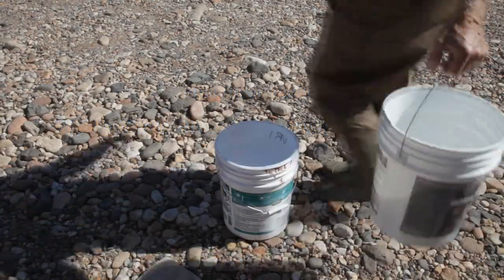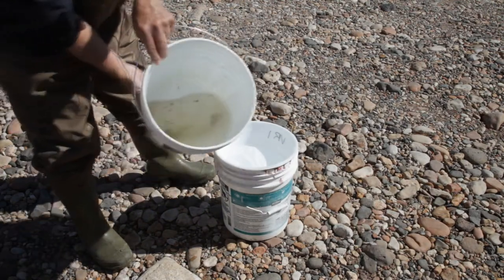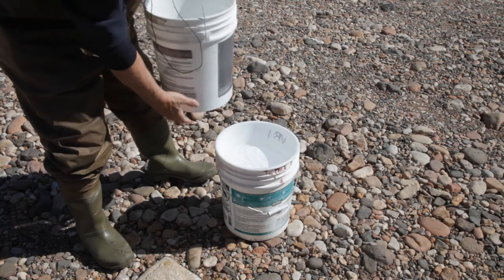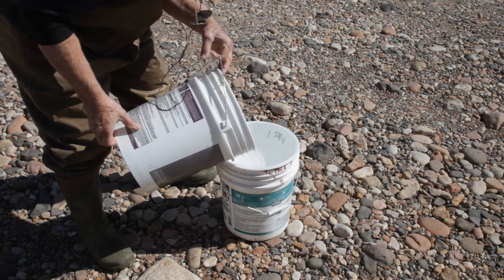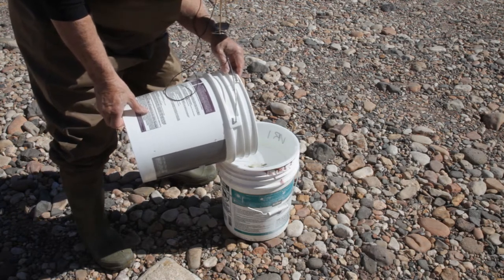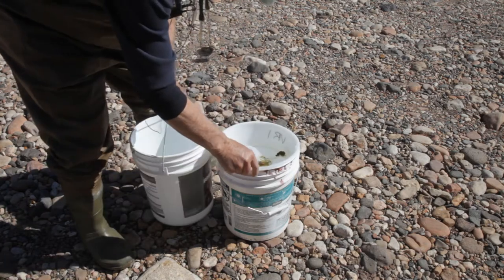We've just returned from gathering our specimens from the stream bottom, and the first thing we're going to do is decant what we collected out there through this bucket sieve, which is a 400-micron sieve, into this other bucket which has been cleaned. This is going to reduce the amount of water we have to deal with, yet make sure that we still have all of our critters in here.